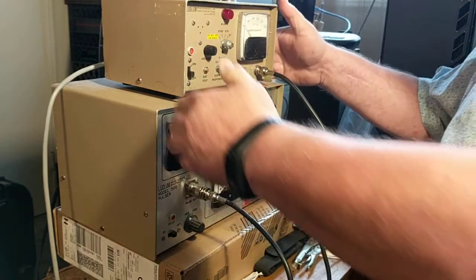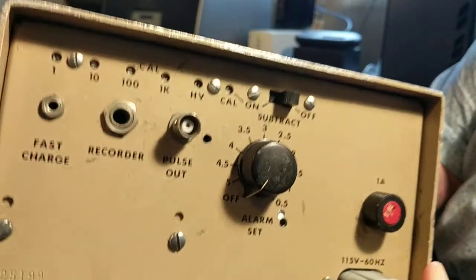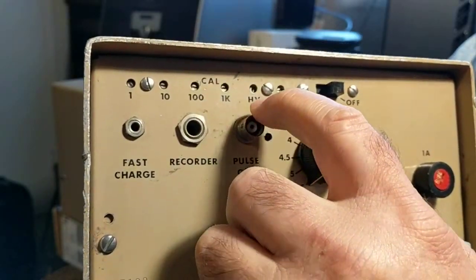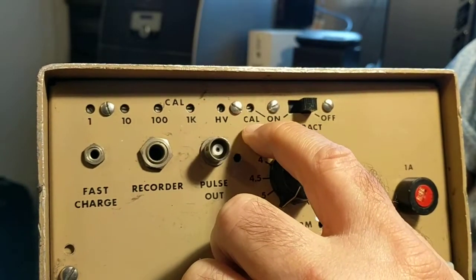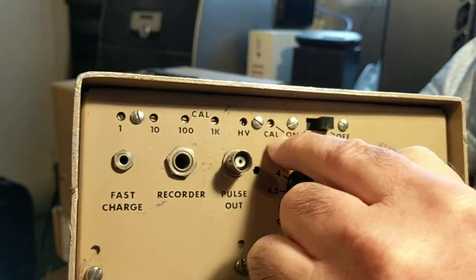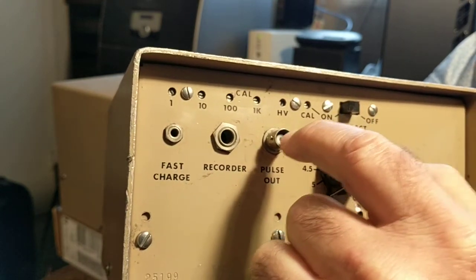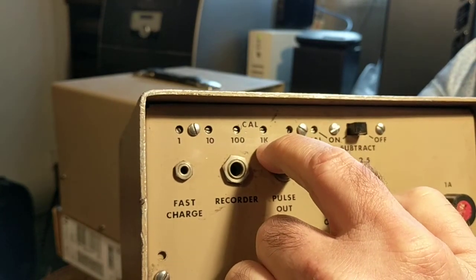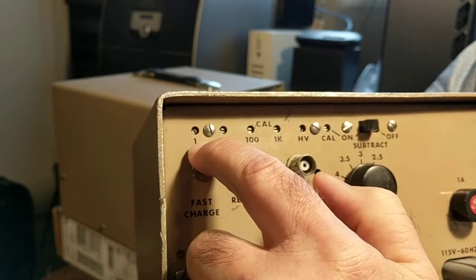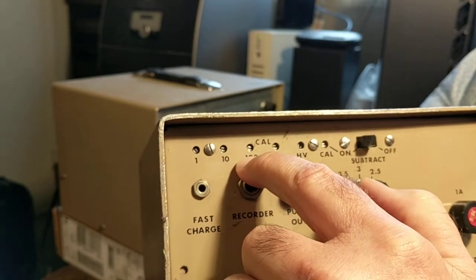Here the high voltage is set by this set screw. The calibration or discriminator is set here. When doing this calibration, make sure that this switch is set to ON. Then calibrate each scale, making sure that the counts match what the pulses coming out are — these numbers: 1, 10, 100, 1,000.